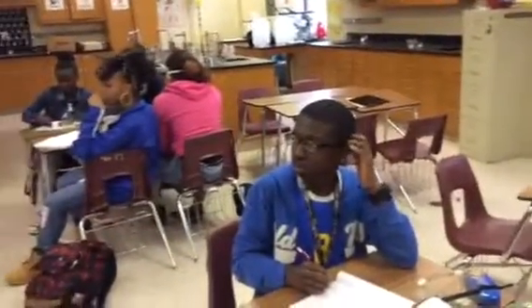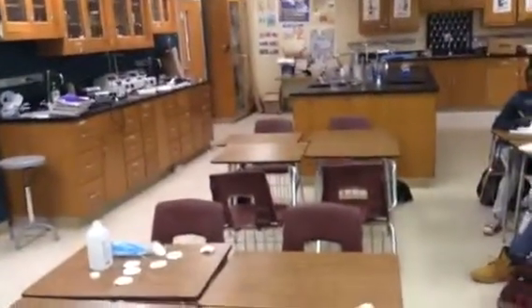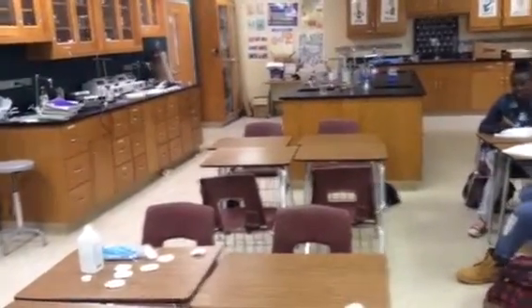How long are you going to let it sit? 10 minutes. So we'll put a timer up. I'm going to put it up for you. Are we ready to begin? Do you have your table ready to record your observations?